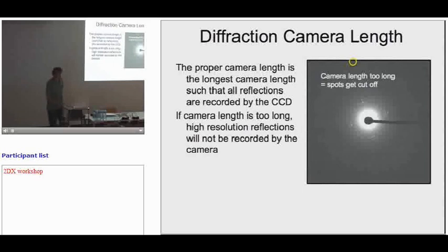If you are using what's called the nanoprobe mode, where you allow the beam to be parallel, there's a point where you get a parallel beam. Remember how Janet was describing it? To get a parallel beam, your source needs to be at the back focal point, right?